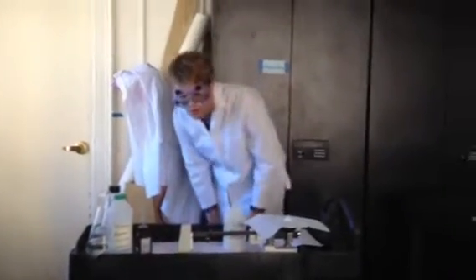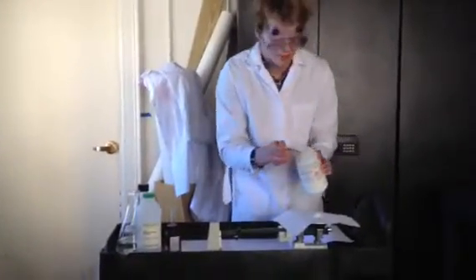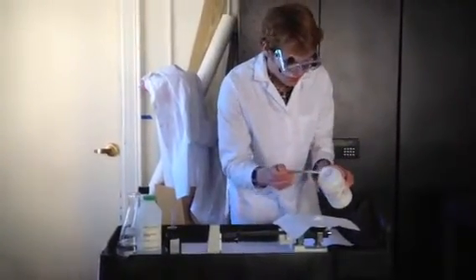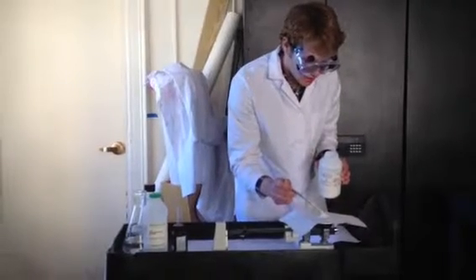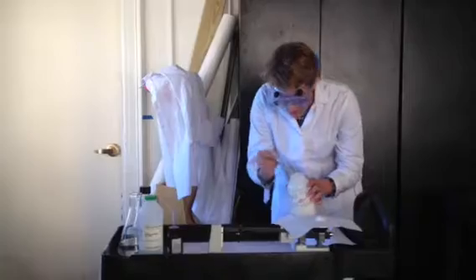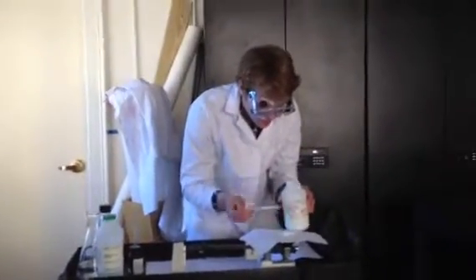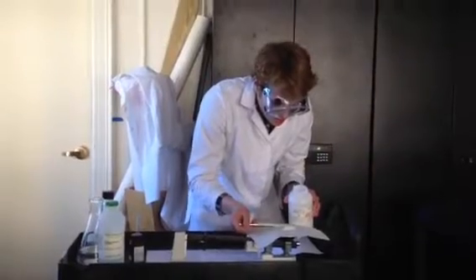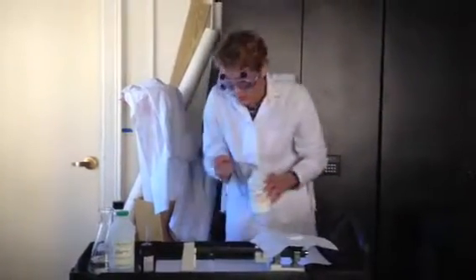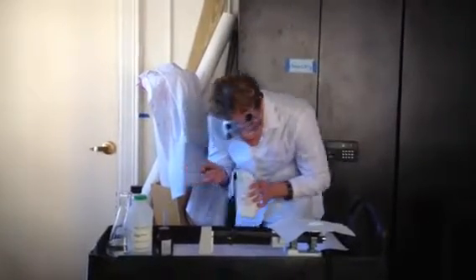I'm just going to let this level out. Alright. And so why do you guys think we're using dextrose? Any guesses? Does it have a full valence shell? The opposite. So if it doesn't have a full valence shell, but it's still part of a redox reaction, what does that mean? That it doesn't have a full valence shell. Exactly. So it wants electrons when it comes in contact with something with a full valence shell.